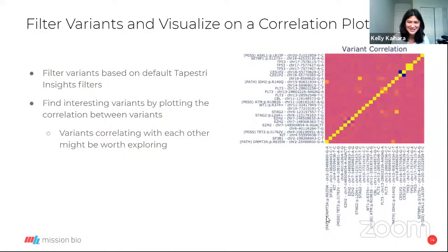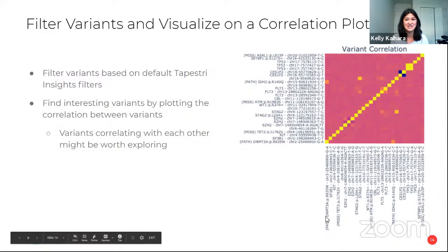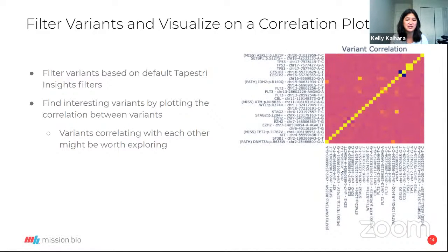We know from bulk sequencing that these two mutations are important for this patient sample. And then with the ClinVar annotation that our software does, we also know that these two variants are important because they're labeled as such and identified as pathogenic versus all of these other variants that either are intronic or benign or have no known pathogenicity. So for the rest of the presentation and what we did with the analysis, we focused on these two variants and wanted to explore them further.